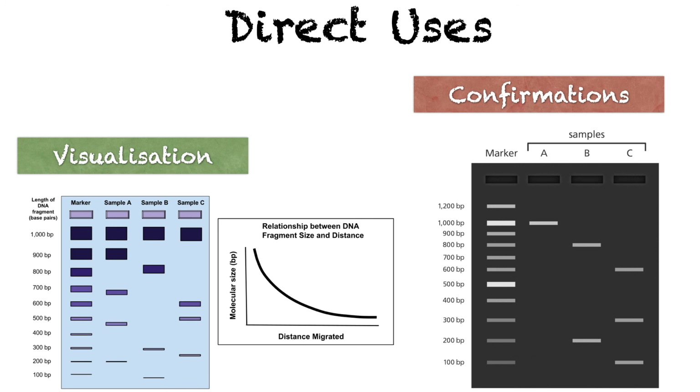After doing the experiments, we have some aim we wanted to achieve, and we don't know if we are doing the right job. Then after the experimentation, to confirm that the experiment we have done is going in the right direction, we do the electrophoresis. Once we do the electrophoresis, in a similar way, by comparing with the marker, we confirm that our work is going in the right direction.